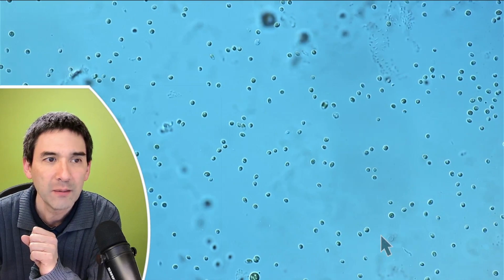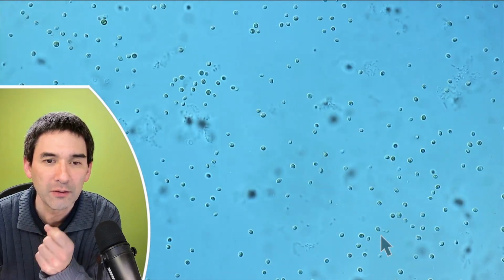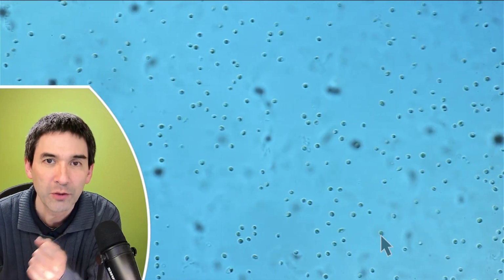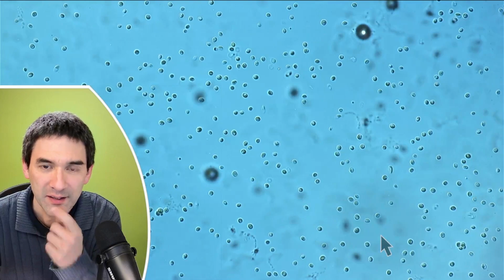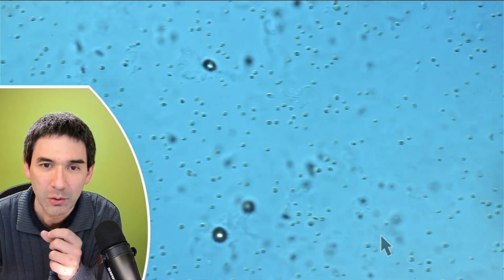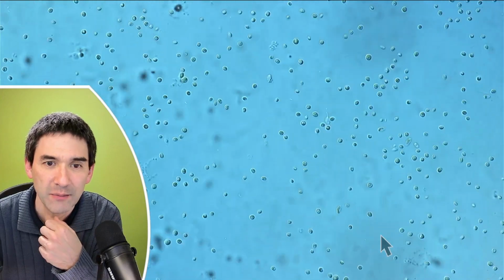What I would like to do now is go back here, and maybe I'm going to find again a ciliate. I would like to talk a little bit about the random movement of microorganisms and the directional movement of microorganisms. So basically when they move on their own. It has nothing to do with Brownian motion as such, but it's also interesting because you also find both of these cases in microorganisms.